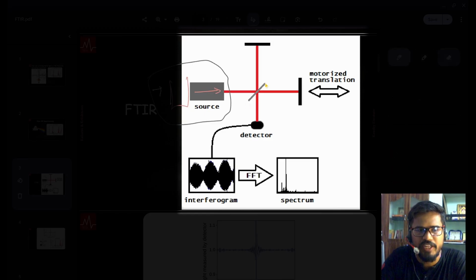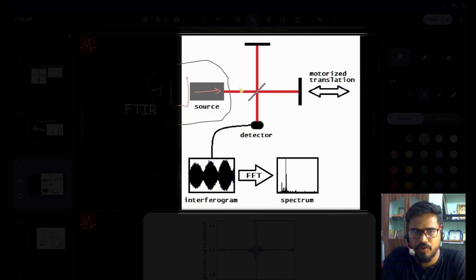It will partially reflect and partially allow light to pass on. So partially things will reflect to this side and pass through to the other side. There is a mirror here that is fixed, so after one more reflection, the light heads back, and again partially reflects and partially passes. A small part of that will show up here.